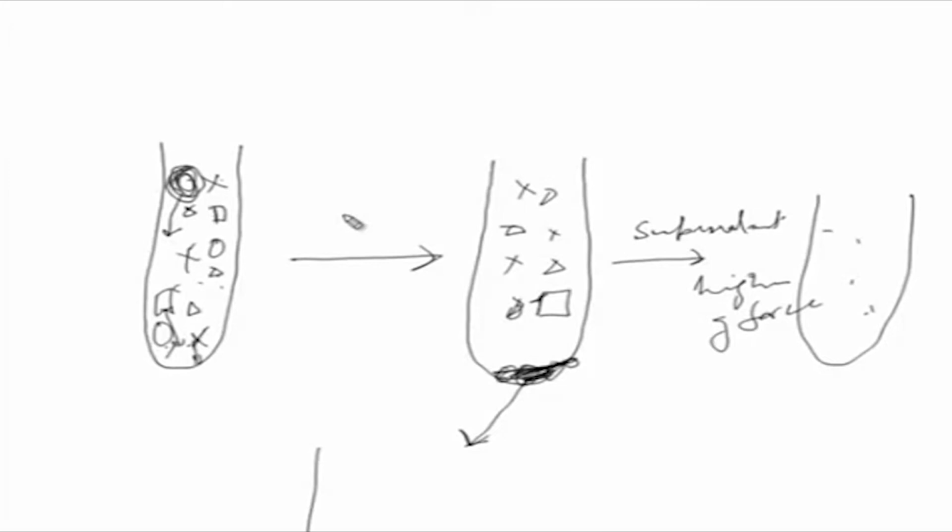This pellet will contain more of these, but it will also contain other smaller ones. Again it will be centrifuged, and this process will be done many times to get the pure fraction. So, you can achieve reasonable purity by going through these steps of repeating the centrifugation at that speed by taking the pellet and doing it many times, so that you can get the pure fraction.